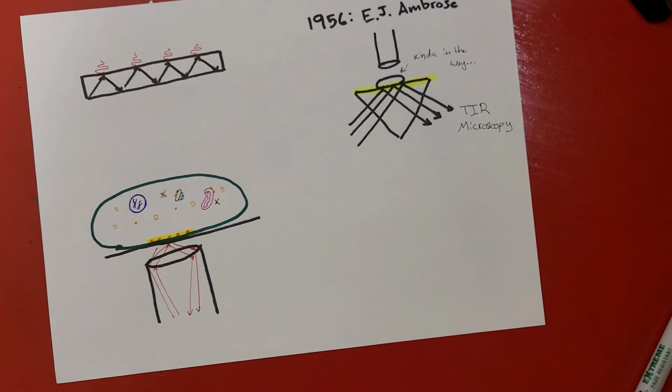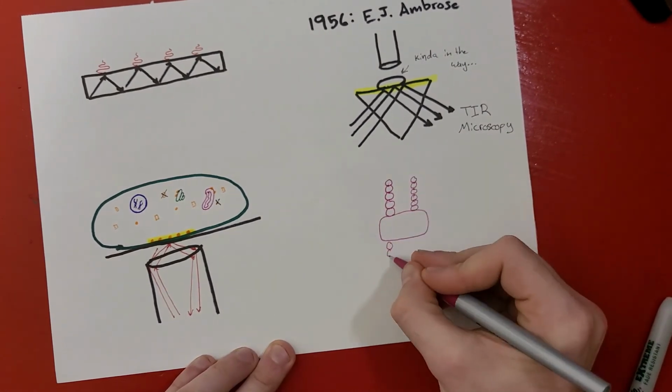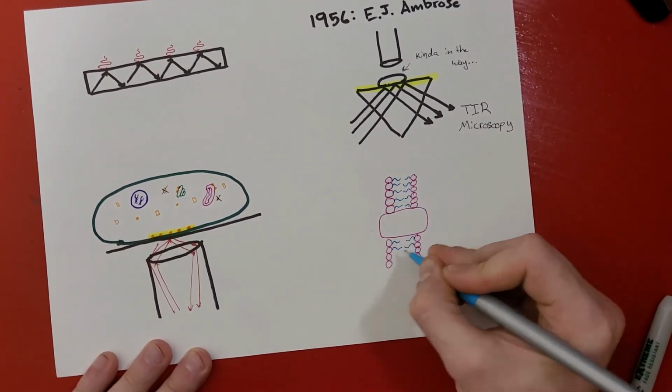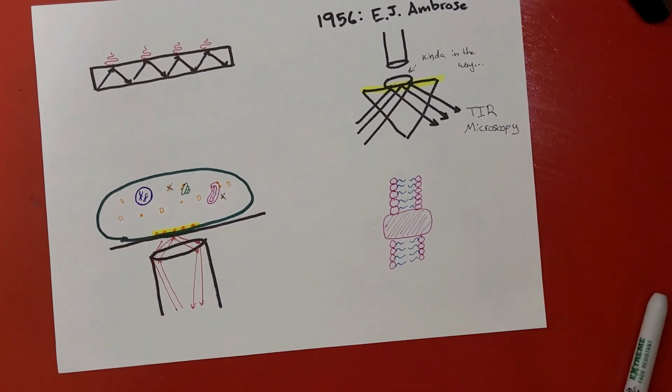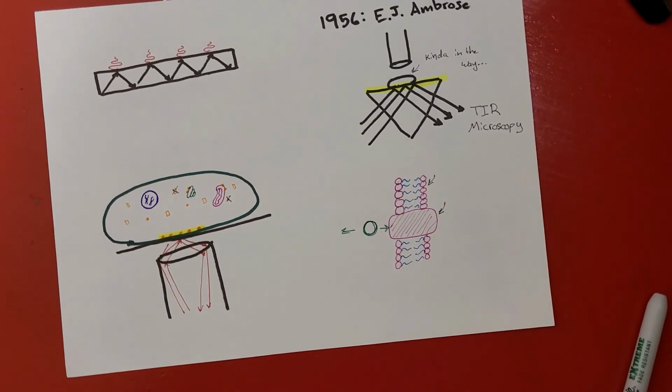In the realm of biophysics, TIRF microscopy is particularly well suited to studying membranes and processes related to membranes. This includes studying the bilayer and proteins involved in the membrane itself, vesicles entering and exiting the cell, interactions between cells, and many other applications. Beyond the observation of cells, TIRF has a wide array of uses for single molecule detection and can be combined with other single molecule and super resolution microscopy techniques.